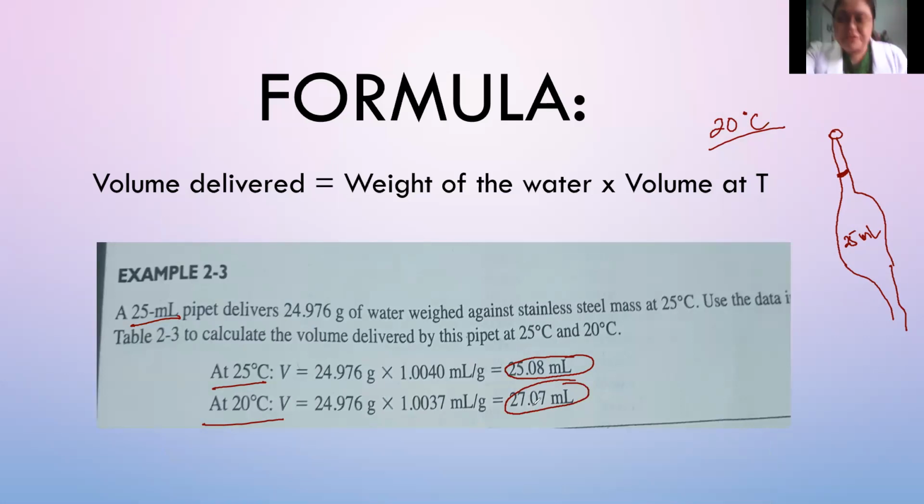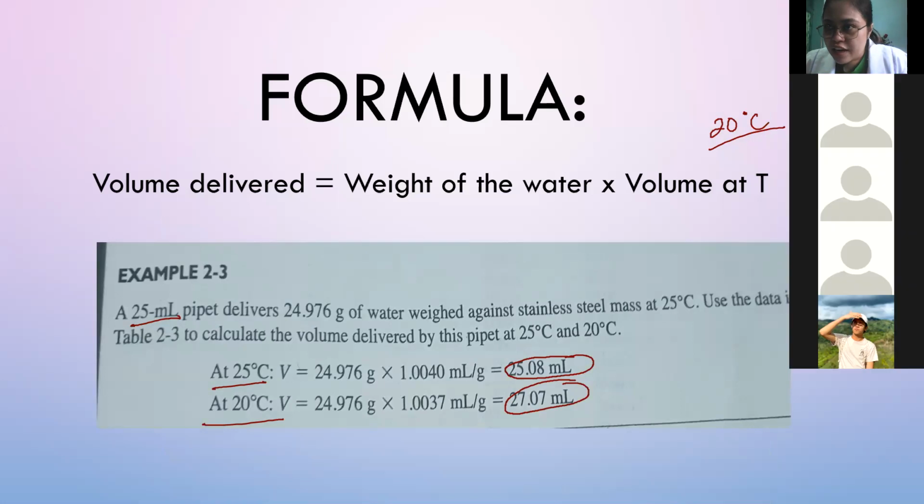If we have differences between the recommended temperature and the temperature of the solution you measured. Okay, I am not asking you to memorize the table. When I ask you to compute, you can look at the table anytime. Questions, class, about the calibration of the pipette?